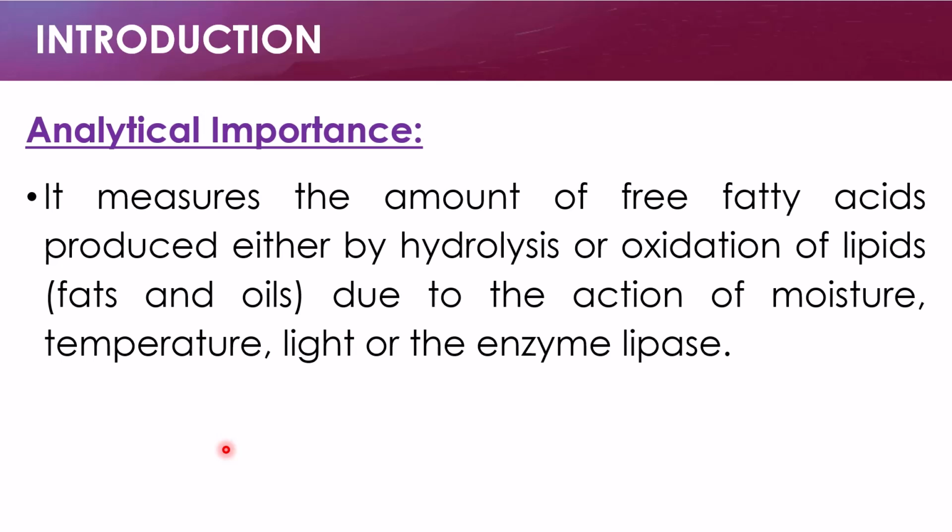Let us look at the analytical importance of the acid value. The analytical importance of acid value is that it measures the amount of free fatty acids produced either by hydrolysis or oxidation of lipids due to the action of moisture, temperature, light, or the enzyme lipase.